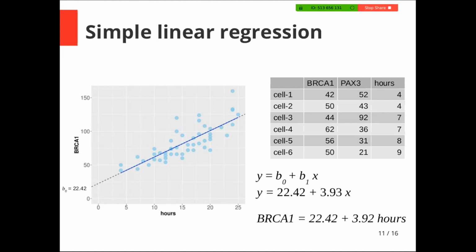And this is the effect of the hours. And if we put these hours here, it will give you some value for this one. That should be very close to this one. It won't be exactly that one because the model has some error, but it will be close. And you can add that error here, which I didn't add here. So that is how it works.